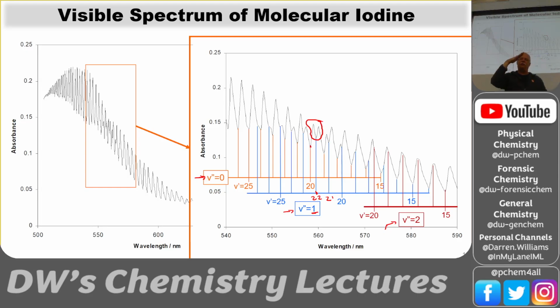It really doesn't become a minimum. It's sort of an inflection point that you're looking for, and so these right here are the hardest ones to do. This one, this one, this one, this one, this one. So they're accurate, but I could understand if you're looking at that going, I don't believe you. Right? So I would say just do these. Follow the key and try to find them and pick the best point that you think you're picking, according to this key. But once you get to 20, you're really not going to be able to get it.